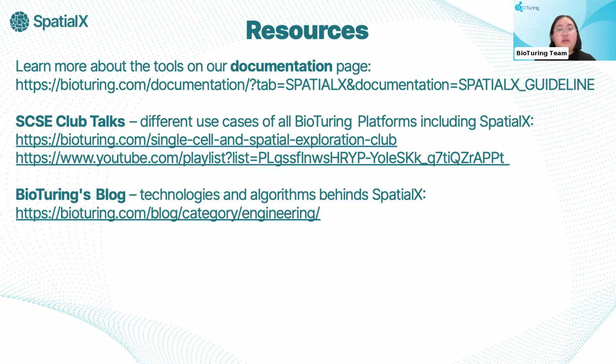Oh, so in here I have a request to include detailed video tutorials for the advanced features and analysis. So yes, of course, we will include that, because this session is very short and it cannot cover everything. So we will upload that and we will definitely share it on YouTube. So yes, thank you a lot.